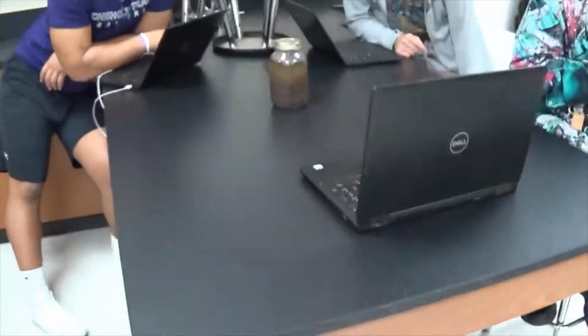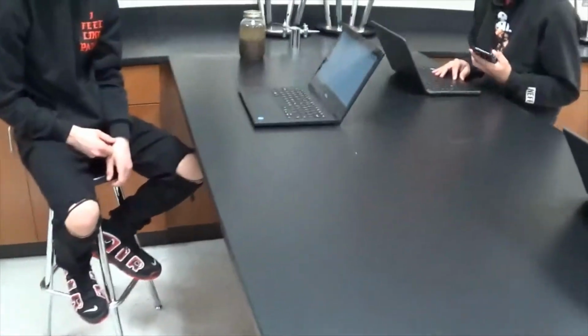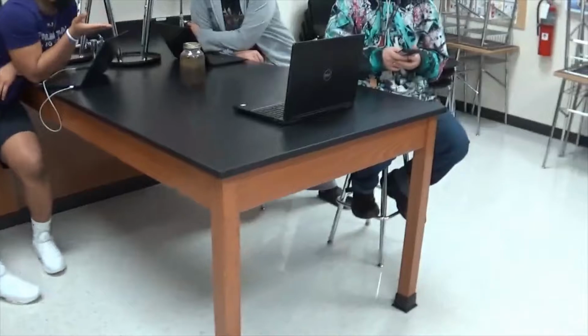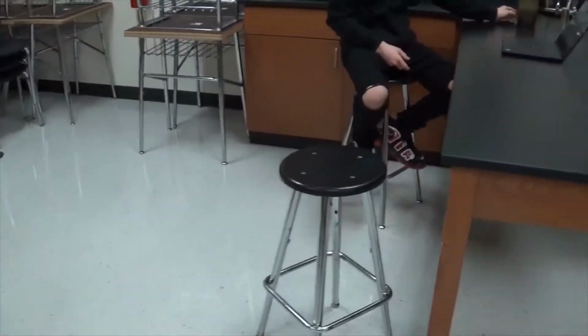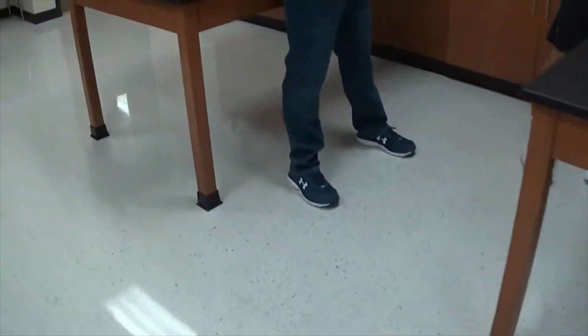Okay, so we have our samples from yesterday. Yesterday we agitated the samples and then we let them set overnight. What are some things that you observe about the sample as it has set overnight? Most of everything other than dirt, like wood chips, rises to the top. Okay, so we have some matter that's risen to the top, and you mentioned wood chips.